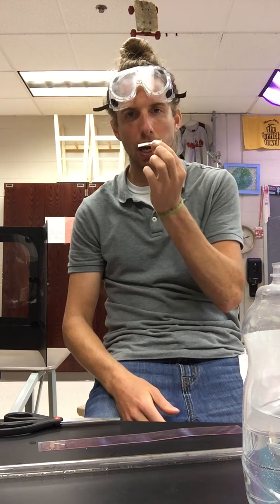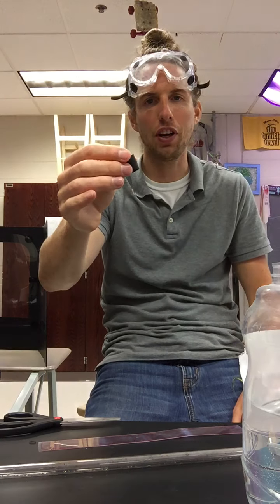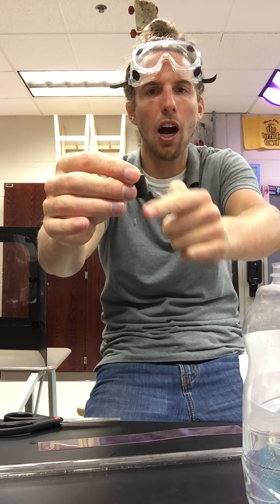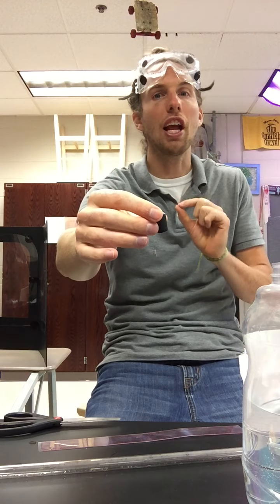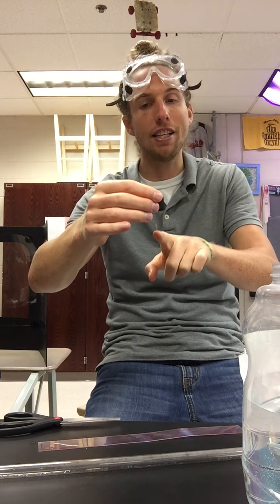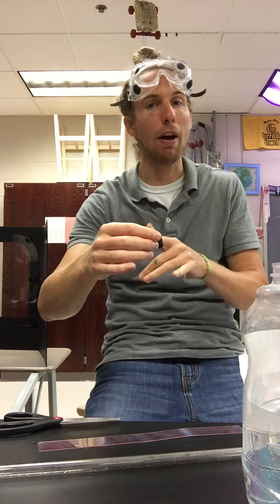The other information that I want to tell you is about my magnesium. I already cut a strip of it, and I strung up this little device over here on a rubber stopper. I've got a piece of magnesium hanging from a copper thread. Now, I want you to think about the activity series, think about hydrochloric acid, think about magnesium, think about copper. The hydrochloric acid should only react with one of those two metals based on the activity series. That's going to be important for us today.